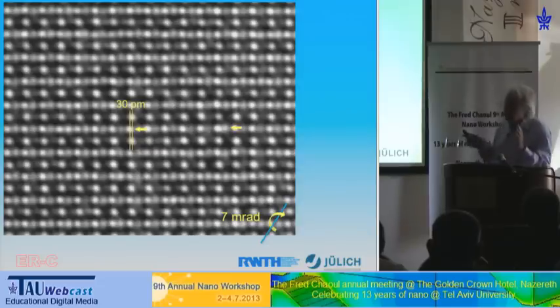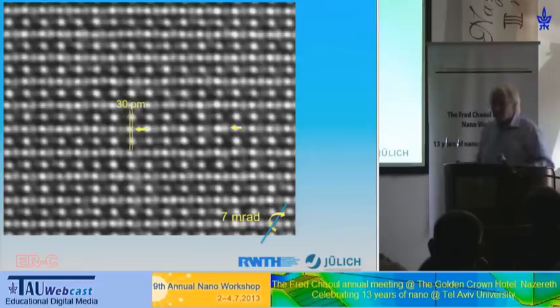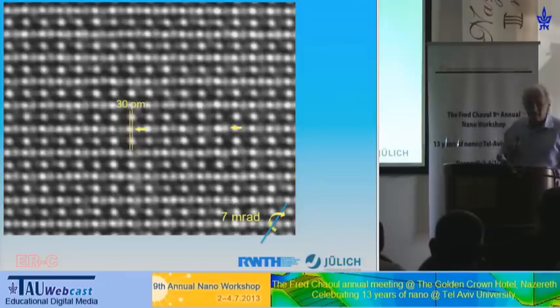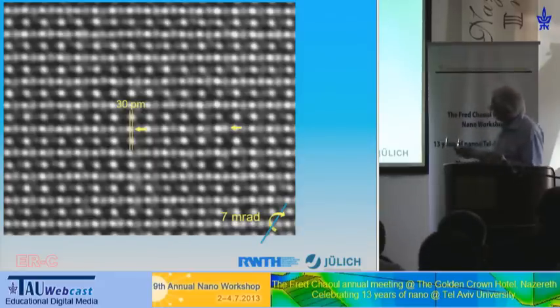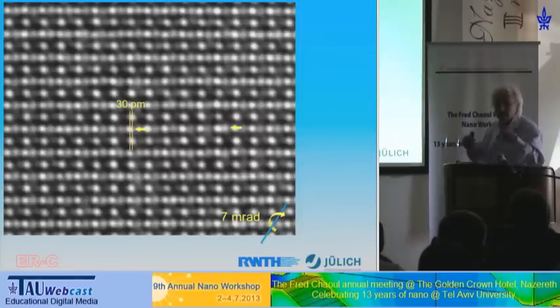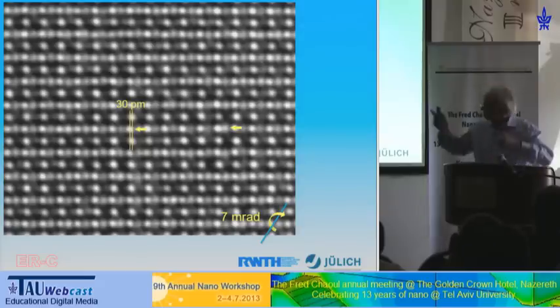So you can say, okay, this is geometry. I just apply to each of these atomic maxima a geometrical factor, and then everything is fine. It's not, because the background of this is something else. Bloch states in a potential react differently to tilt, depending on the nuclear charge. That means when I calculate the solution of the Schrödinger equation for a tilted potential for oxygen, this gives me different tilting effects compared to the titanium. So this is the background of this.